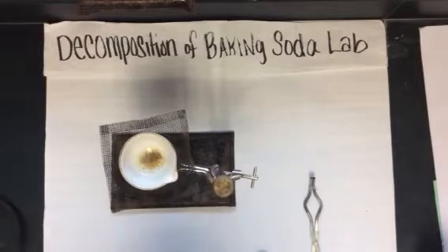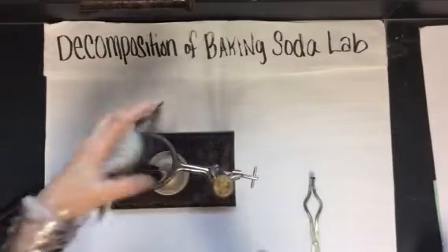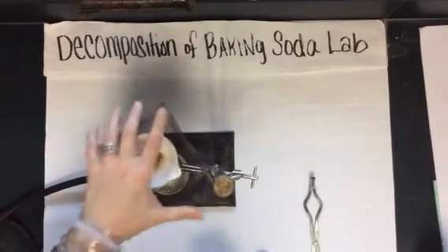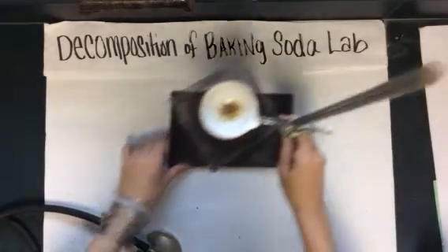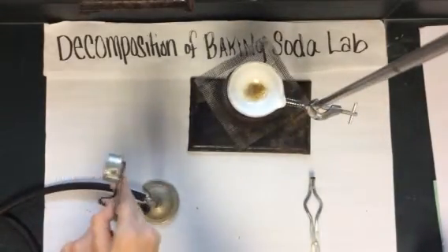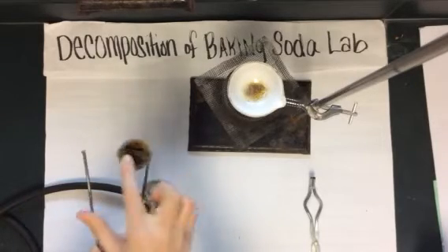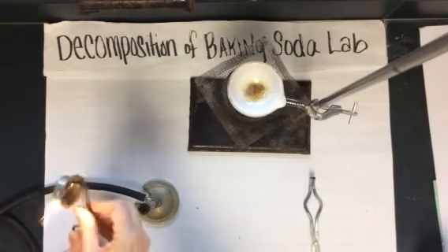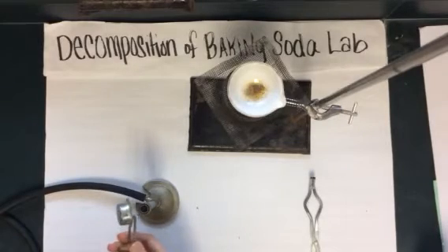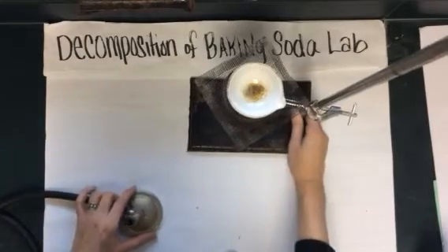Okay? You want to make sure that when your Bunsen burner is lit and placed under here, the bottom of the evaporating dish is touching the inner blue cone to get the hottest heat. So that might require you to first light your Bunsen burner using your striker. And again, to use my striker, I want to push this back and across my striking pad here. So I'm going to take that flint and strike it back and across to make a spark. As soon as I have my flame, remember adjusting it. Okay. Now, here's the hard part.